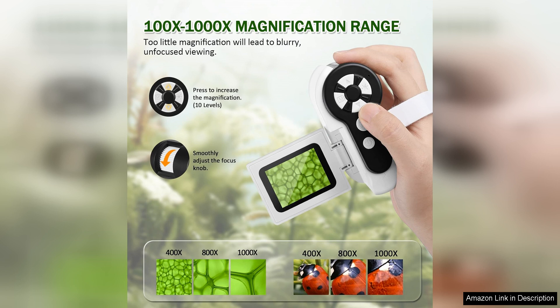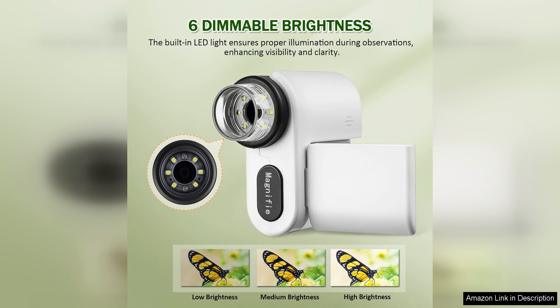The microscope is easy to use with a simple focus wheel that allows children to adjust the magnification level and focus on their specimens with precision. The compact and lightweight design makes it portable and convenient for young explorers to take on field trips or outdoor excursions.